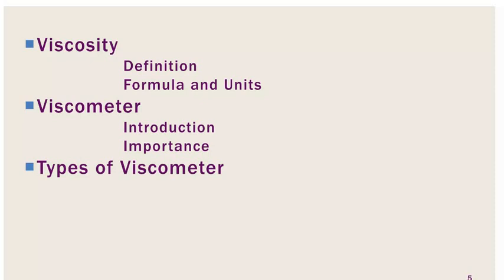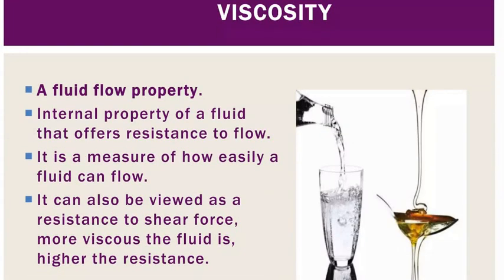Today in this video, I am going to talk about viscosity, viscometer and types of viscometer. So what is viscosity? What is viscometer and types of viscometer? The definitions, formula and units, introduction of viscometer, and importance of viscometer, I will discuss in this video. So let us start with the viscosity.